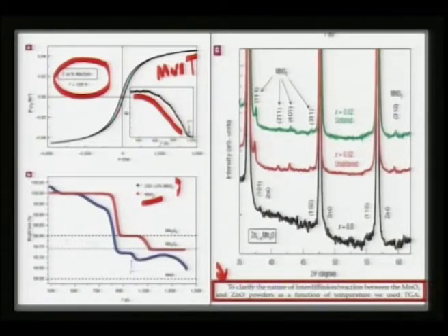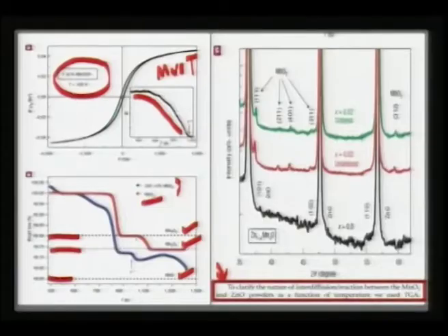a sharp fall, and all these horizontal lines that you are seeing here are the calculated values for different compositions of manganese, namely Mn2O3, Mn3O4, or MnO. These are the components that can come if you take MnO2 and heat it in air. So if Mn2O3 is forming, then this should be in the first plateau. If Mn3O4 is forming, this should be in this plateau.